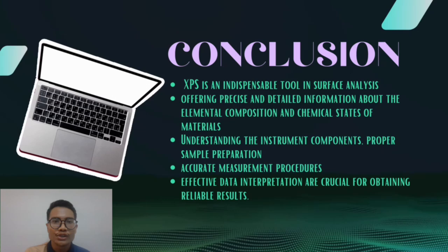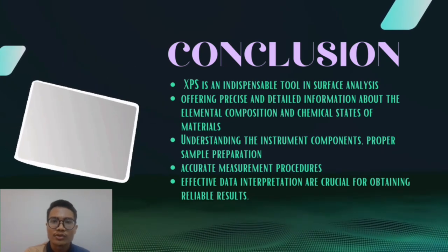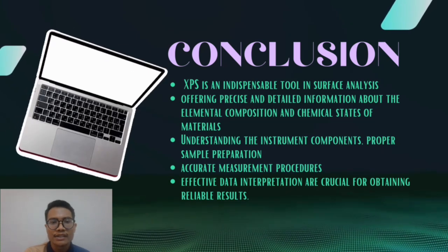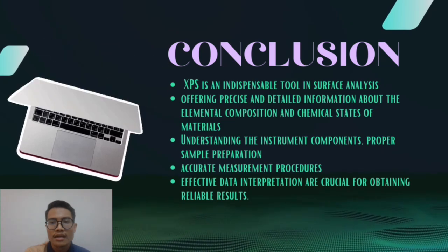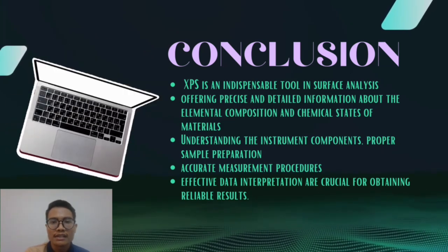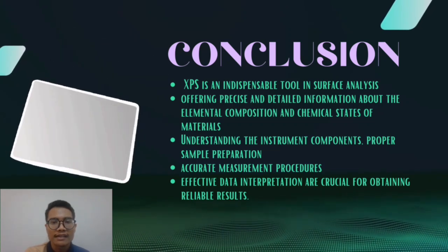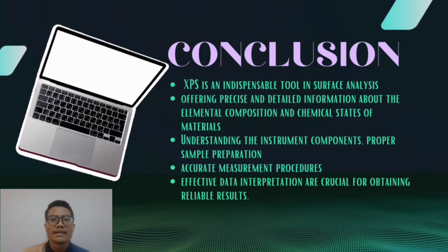So, in conclusion, XPS is an indispensable tool in surface analysis, offering precise and detailed information about the elemental composition and chemical states of materials. Understanding the instrument's components, proper sample preparation, and also accurate measurement procedures and effective data interpretation are crucial for obtaining reliable results.